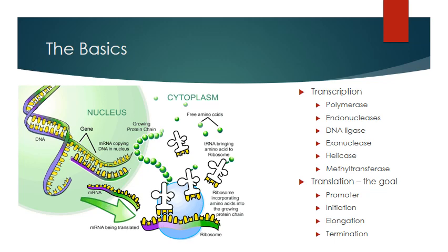They basically encourage or enable pyrophosphate exchange between the nucleotides, so that you end up with a bond, right? You produce a chain. And there are various types of polymerases. If you've done any kind of PCR, you know that is true. Then you also need exonucleases, and these are all enzymes that you'll find you'll need during PCR.